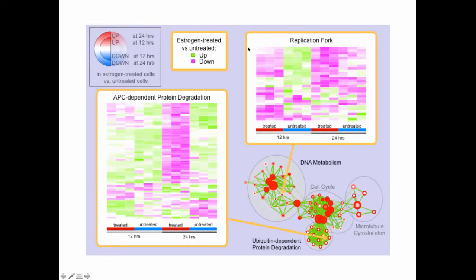You can also go into an enrichment map and see a heat map visualization of the gene expression data. You can click on nodes to see that indeed, ubiquitin-dependent or APC-dependent protein degradation is very similar between experiment and control at the early time point, but very different at the late time point. Very quickly you can see that most pathways are the same, with just a couple of areas changing between the two time points.